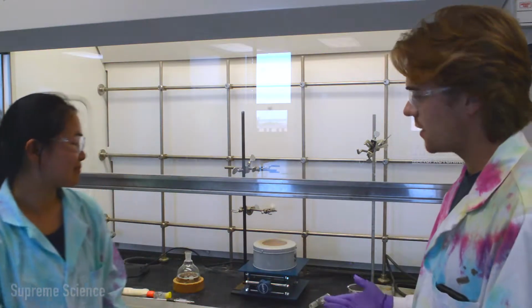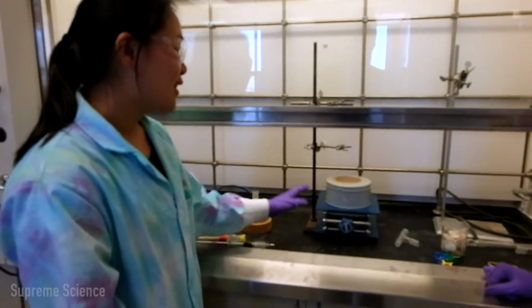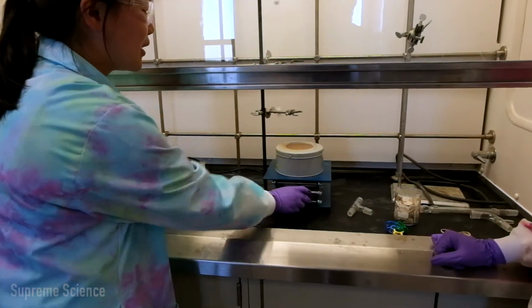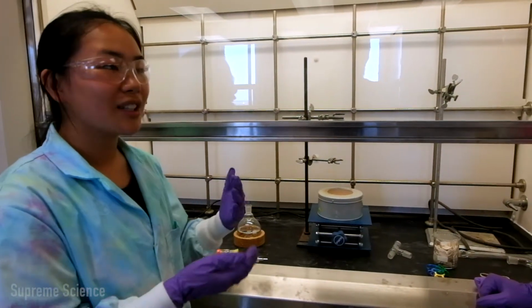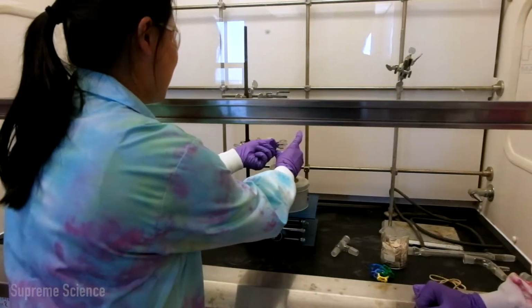So let's look at the apparatus. The first thing you want to do is make sure you have this jack set up here, because this allows you to move your heating mantle up and down. The important thing is you can lower the heating mantle very quickly if you need to remove the heat right away. Clamp that to the retort stand.